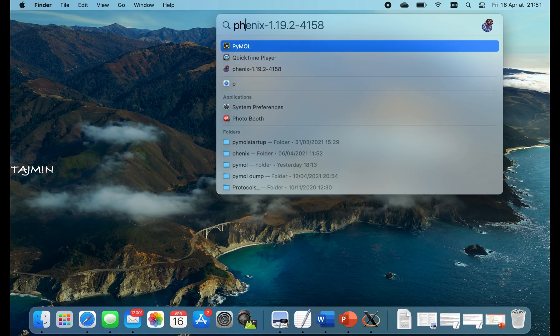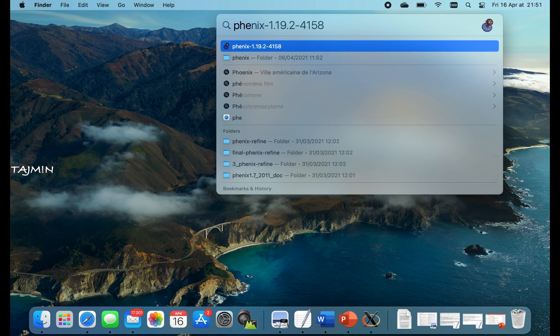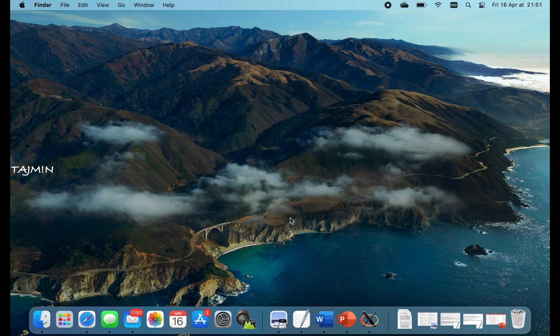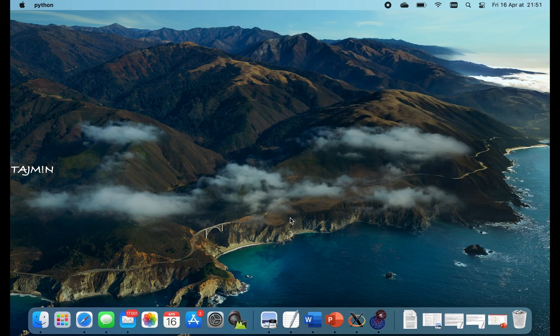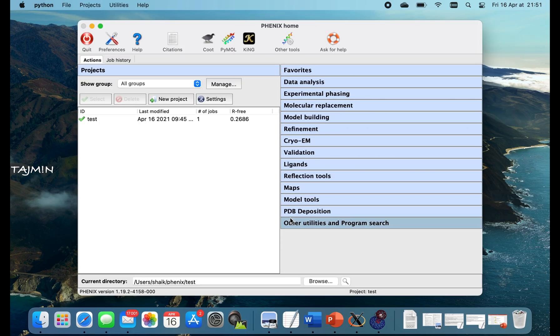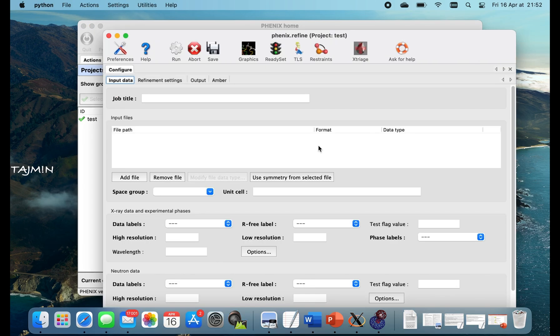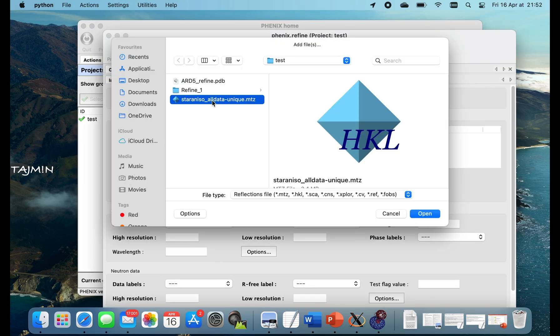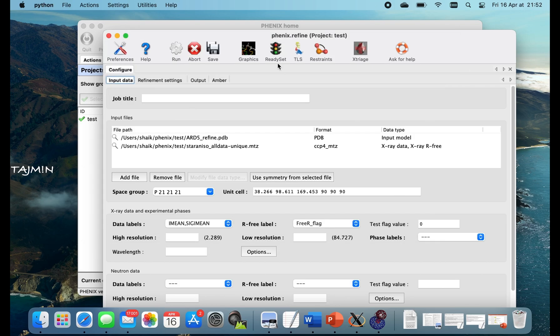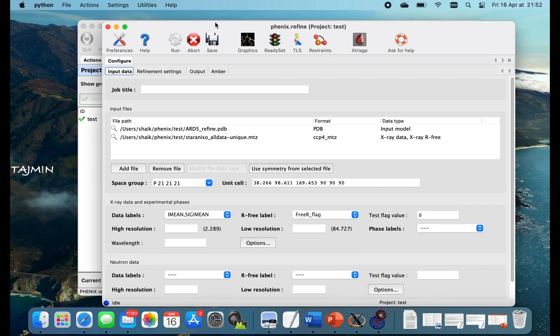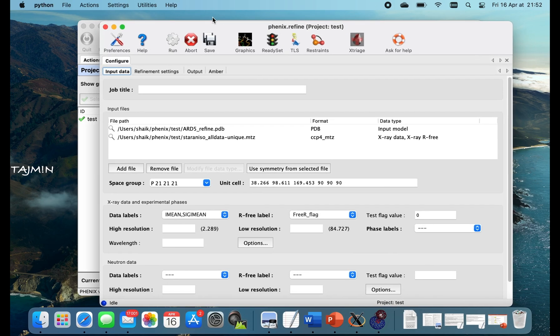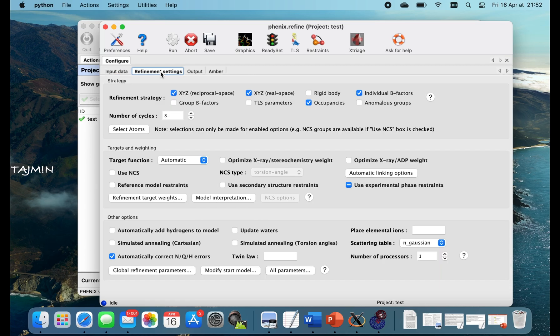Finally I will try to do a refinement in Phoenix and show you how quick it works. And simultaneously we try Coot and check the maps. So we do a simple refinement here. I have uploaded the PDB and corresponding MTZ. Then go to the refinement settings. We keep everything basic and increase the processors. And check the output.